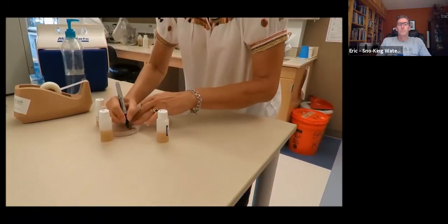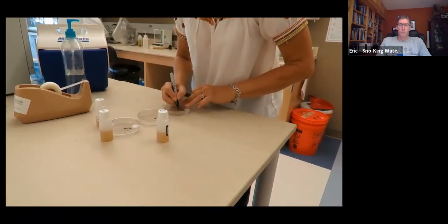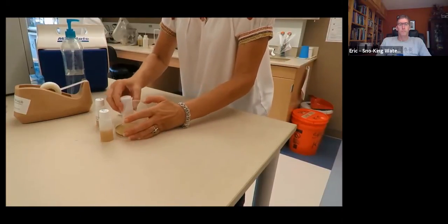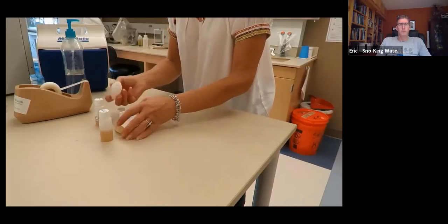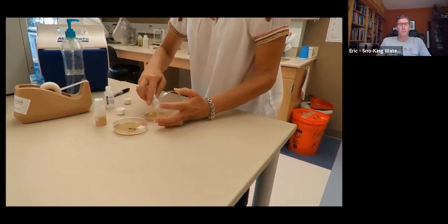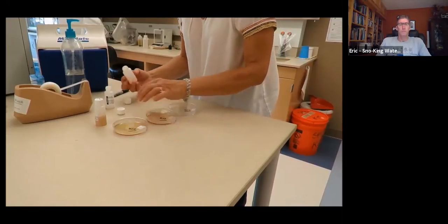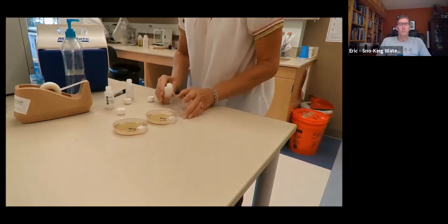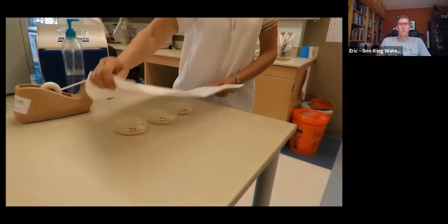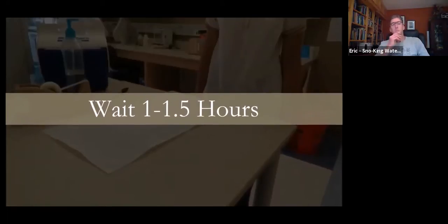Label the plate lids with labels that correspond to the inoculated media bottles in data form. Lift the top of the petri dish just enough to pour the contents of its corresponding media bottle into the plate. Do not slosh the media onto the sides or lid of the plate. Record the time you plated your sample on your data form next to incubation start time. Be sure to shield the sample plates from direct light. Leave the plates undisturbed until the media has gelled, usually about 1 to 1.5 hours.